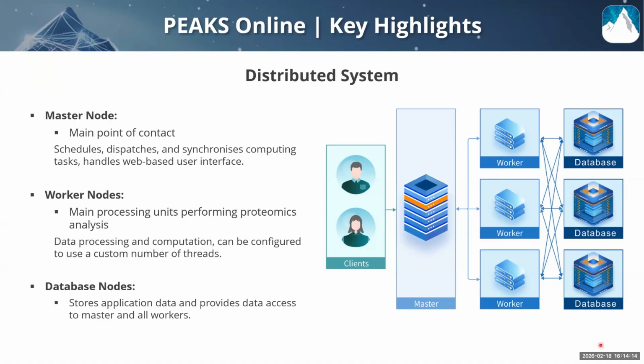Next, we have the database nodes. And the database nodes store application data and provide data access to the master and worker nodes. And this whole system really ensures that Peaks Online can handle large data sets as well as multiple users while maintaining the required stability.